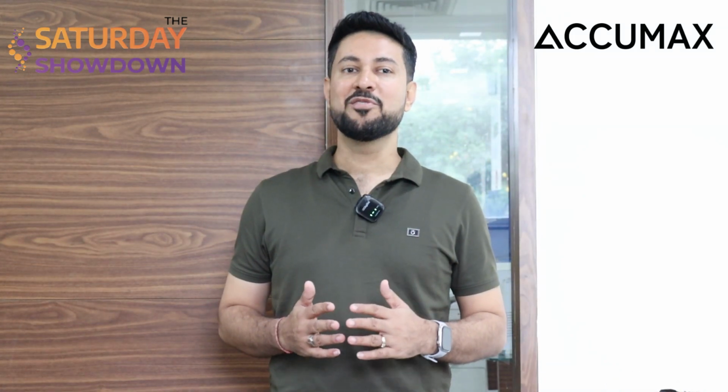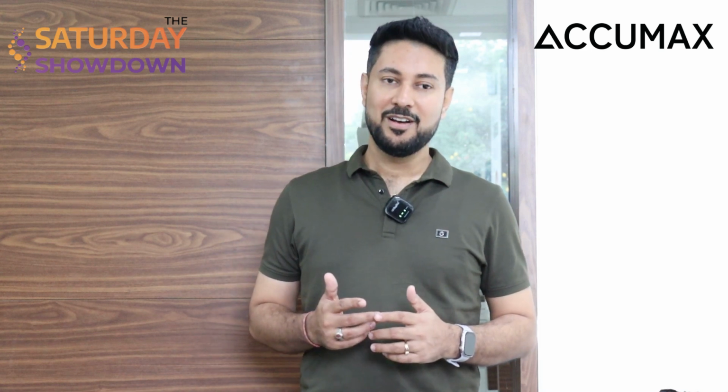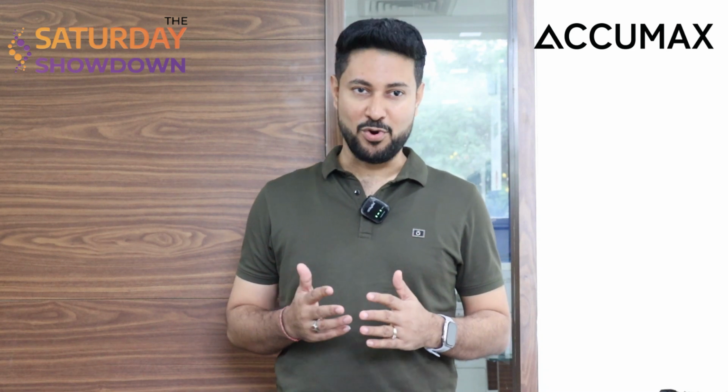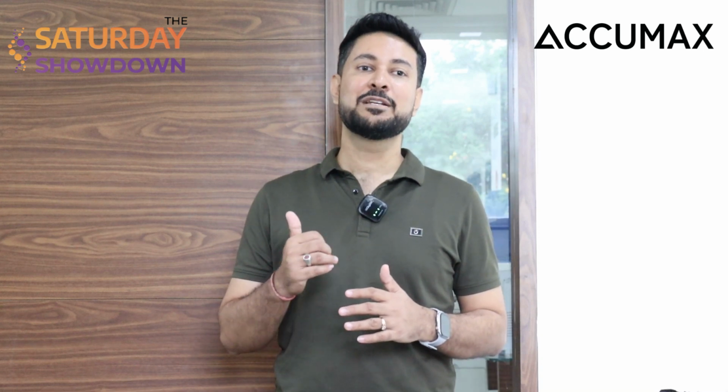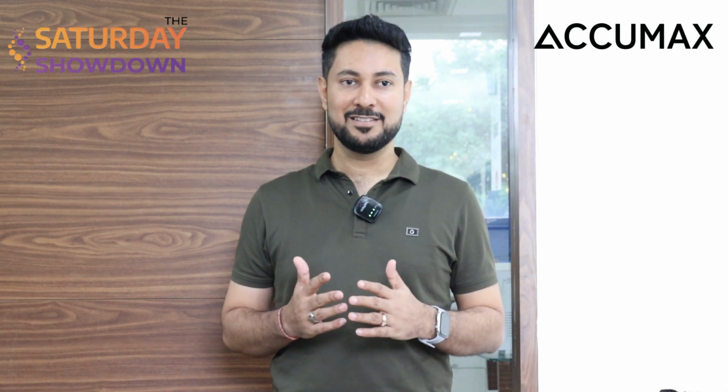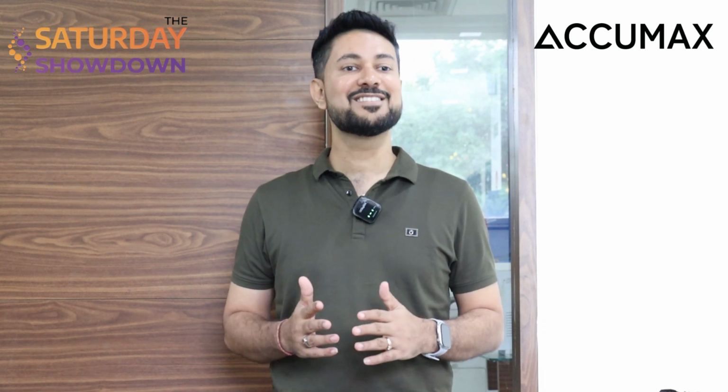Today we have Mittal and Ankit from the Pipette Assembly and Calibration team going head to head for today's contest. Today's contest is more about speed and precision. Both contestants will be provided Accumax Fab Multichannel Pipettes, PCR plates and reservoirs. What they have to do is fill in the maximum number of wells in the PCR plate given to them. Whoever pours the maximum number of wells is going to be the winner of today's contest.